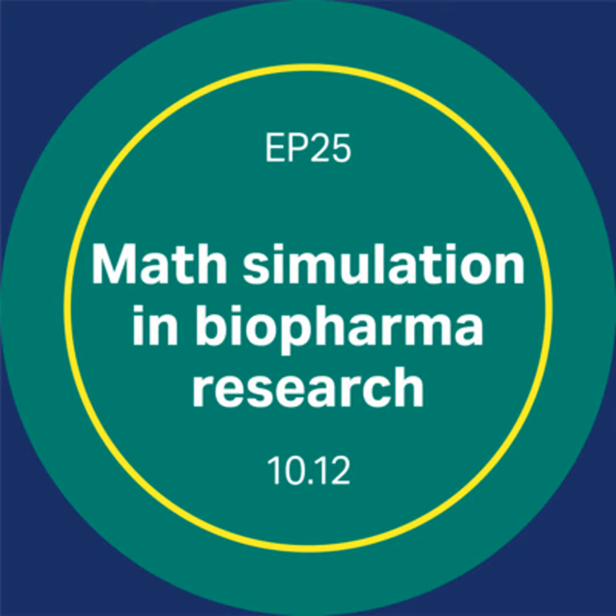And what occurred to me is that for the first time, I understand why things happen. And it's because you have now ultimate causes. That is the physics of interaction in the column. And that's the brilliance of mechanistic modeling. And that is the brilliance that Tobias Hahn brought to an industry that's basically been thirsting for a clean understanding of the reasons why things work and then why they don't work.